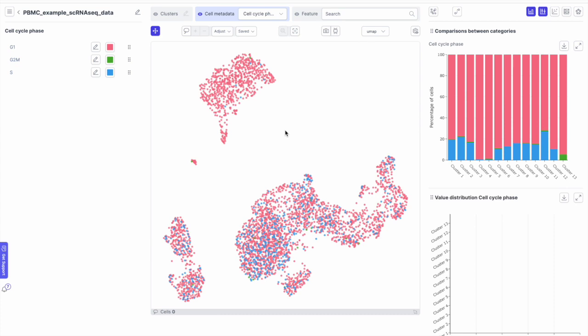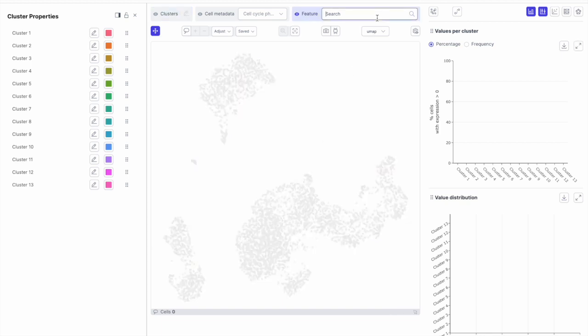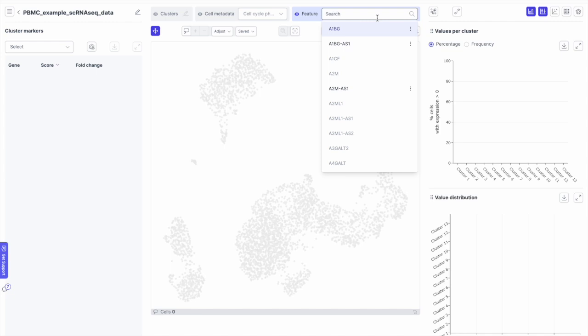We will now start to annotate our clusters. So to do that, we first visualize the clusters up here. And if you hover with a mouse pointer above the clusters, you will see the cluster identity here to the right. So there are many ways to annotate these clusters. One is to look for known key genes. So this is peripheral blood mononuclear cells.